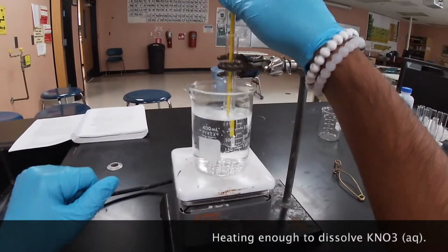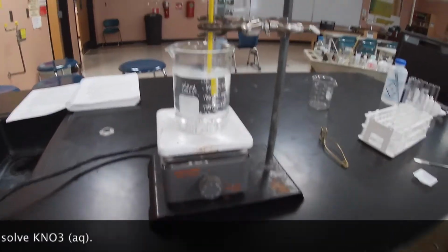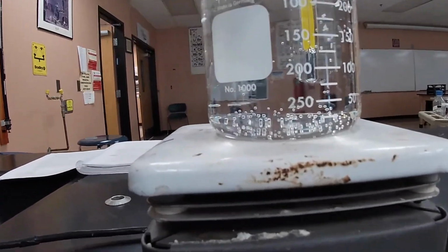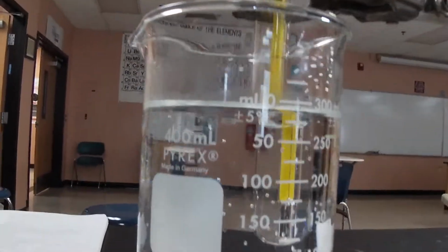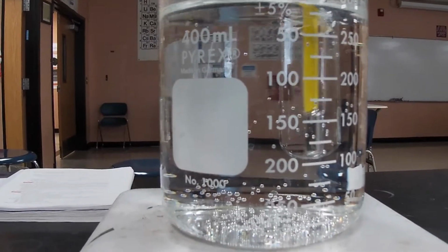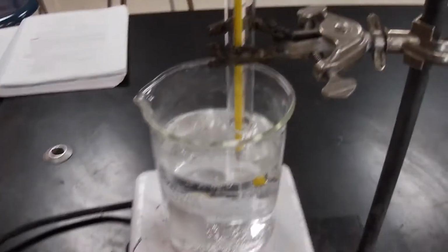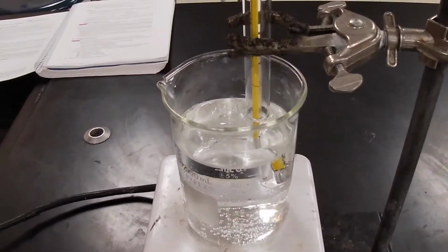As you can see now, all of my salt has dissolved, all of my potassium nitrate has dissolved, and I'm gonna zoom you in, hopefully. As you can see, I have finished dissolving the 3 grams into the 5 milliliters of water. So now I'm gonna remove this from the heat. Okay, and then we're gonna stir slowly and cool down at the same time.